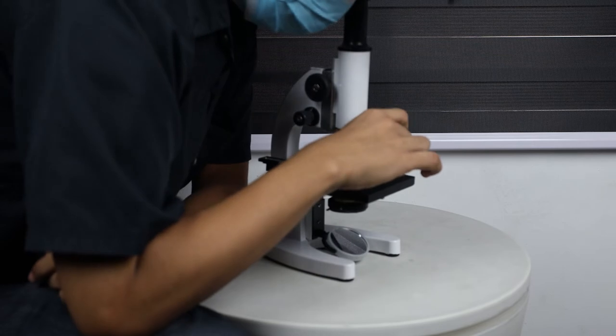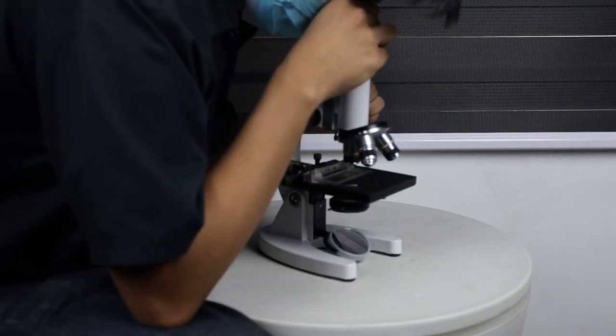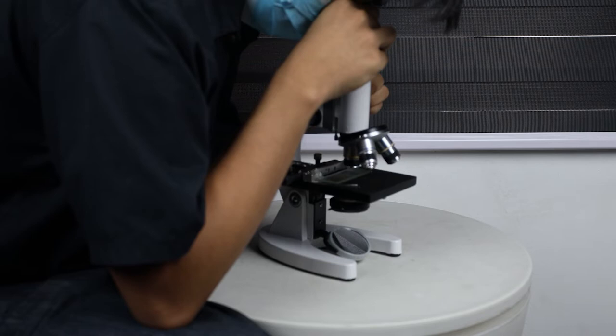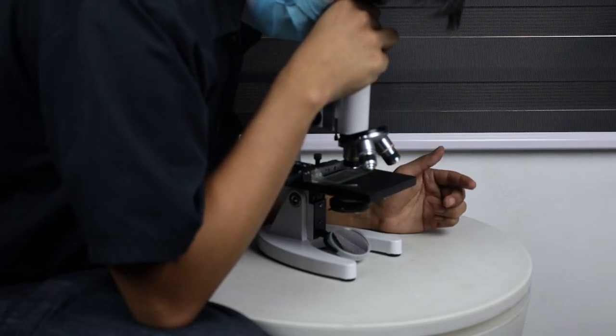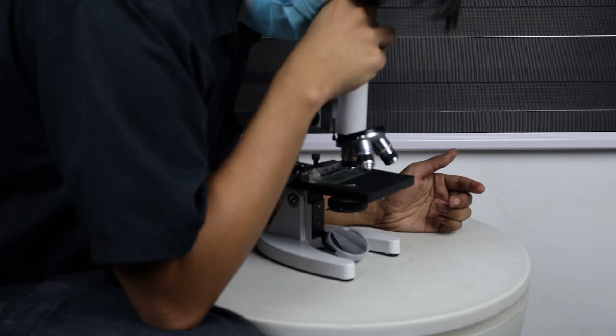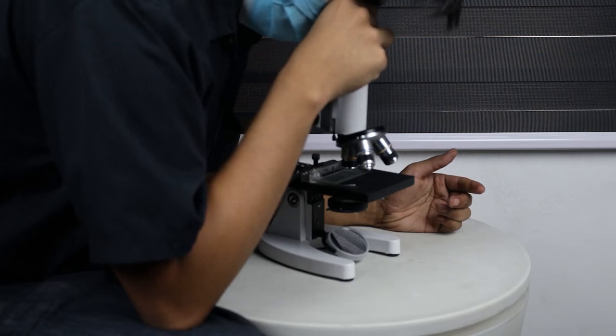Step 5: Turn the nose piece to choose the objective. Objective selected should be set vertically right to the slide. Generally, first use the low-power objective lens to focus to reveal the general structure image. Then use the high-power objective lens to reveal smaller details.